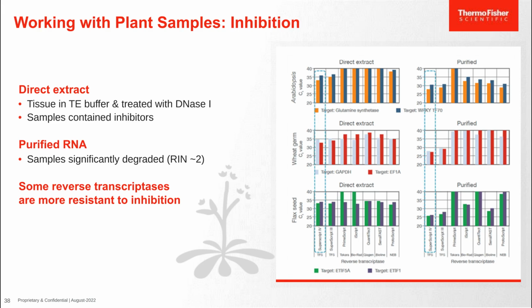In this example, we have tested 7 different reverse transcription reagents with 3 different plant RNA sources to detect 6 different gene expression levels. No surprise again, there is a large variability in the end results.